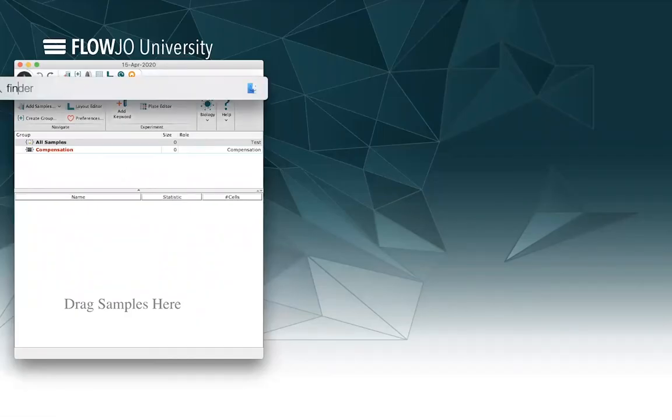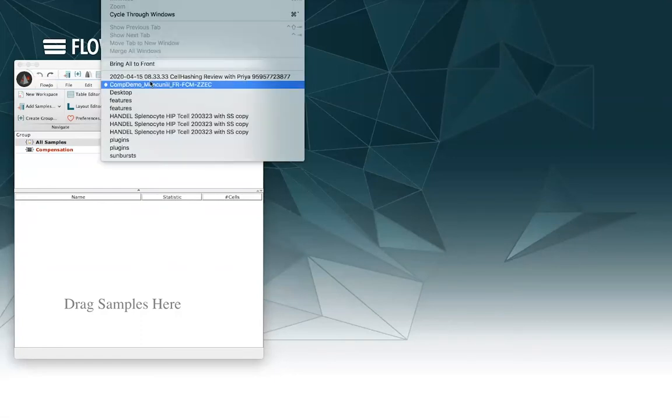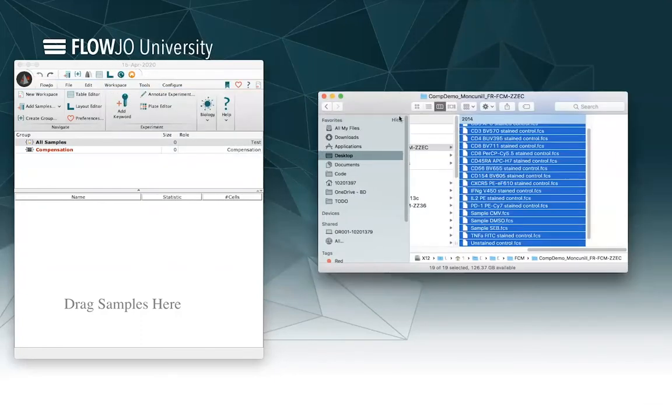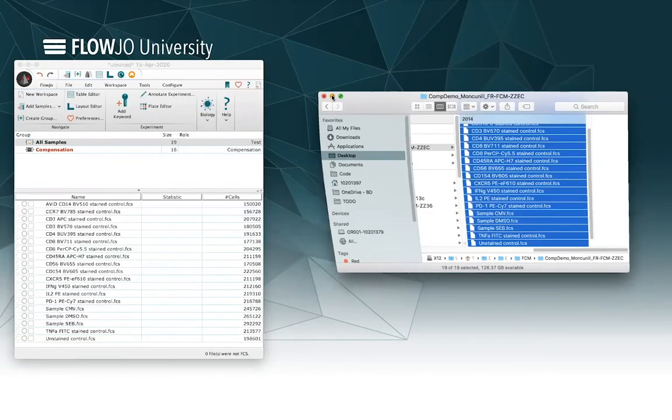First, I'm just going to find with the finder my compensation controls which are here in this folder, and I'm just going to load those into the FlowJo workspace by dragging and dropping just like you see there.